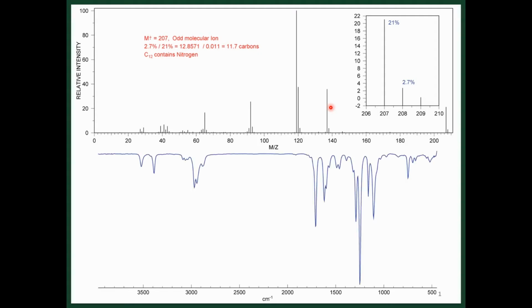So if we're given an IR spectrum that goes along with this data set, we should be able to identify functional groups that are a part of this molecule. So we could look from left to right. Starting here, we would see two little fangs, which we could identify as NH peaks coming from the NH bond stretch. Looking at the CH region here, we should be able to distinguish that we have carbon-hydrogen stretches that correspond to sp2 hybridized systems and some that correspond to sp3 hybridized systems.